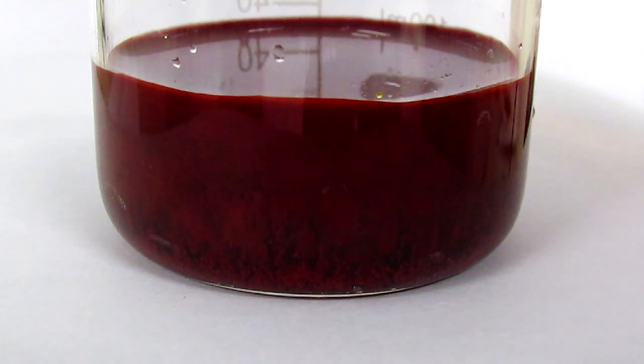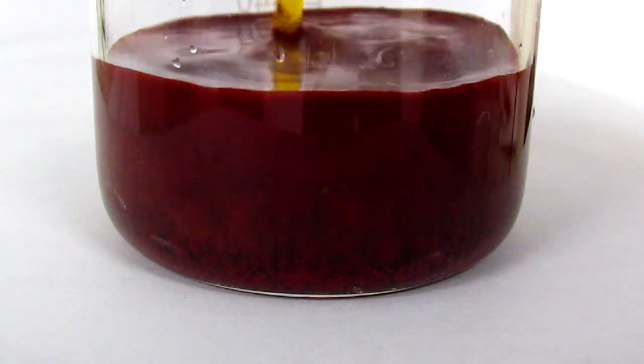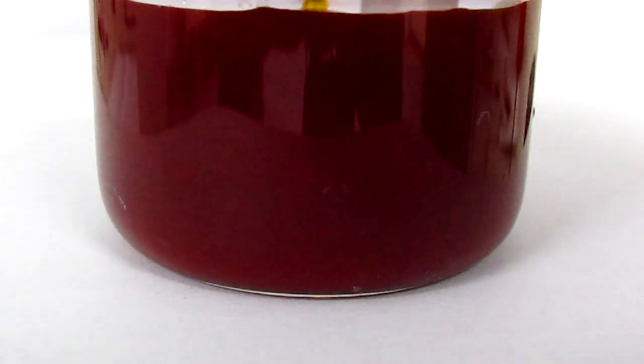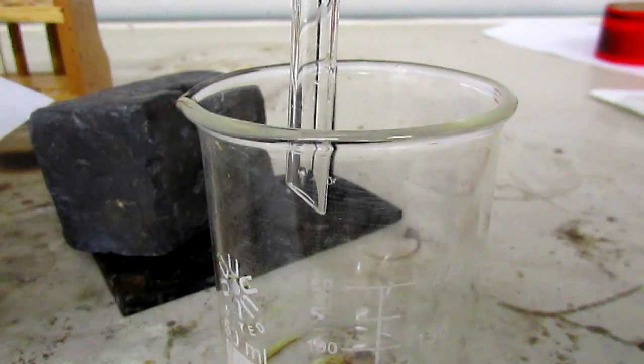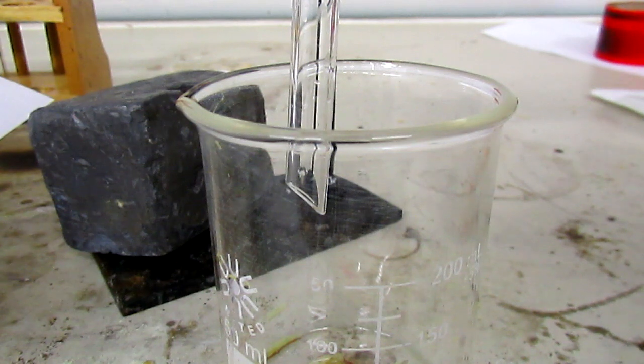I'm going to pour the rest of the dichromate solution in. I expect that some of the product makes it through the filter like it did last time.